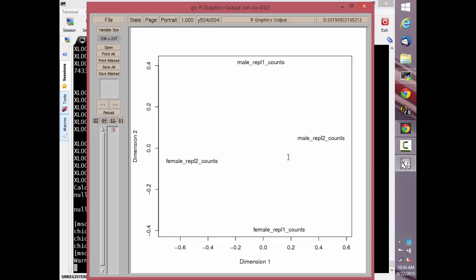Well, yes, insofar as all of the metadata that are not available might give you some information. This is where you start getting into real problems about not having enough replicates. I can't tell you from this whether or not there are real batch effects, because I only have 2 samples of each, and they're as far away from each other as they are from opposite conditions. There could be a batching going on, there could not be. Were all of these eggs in the same incubator? Were all of these eggs from the same hen?